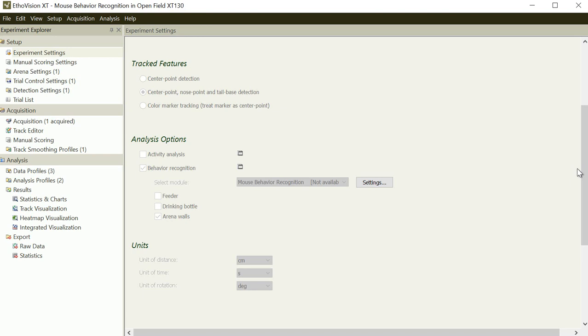water maze, or any kinds of area. Sometimes it may be a field under your microscope. Anyway, you have your site or video where your animal is moving around. You can define your arena.